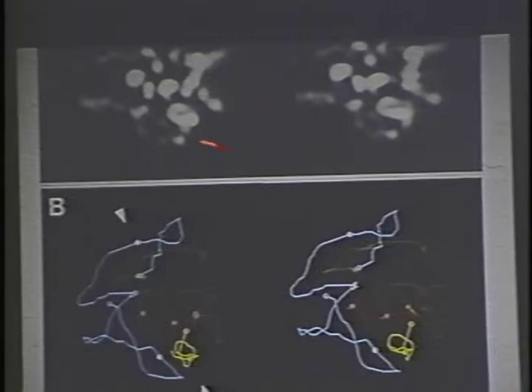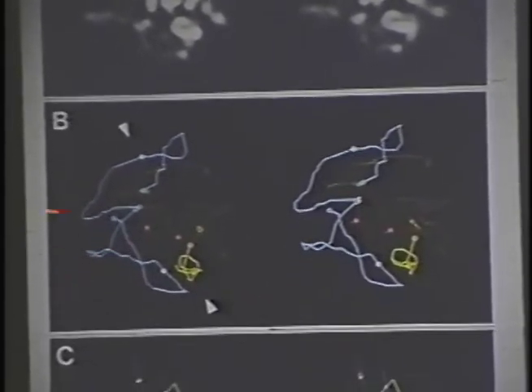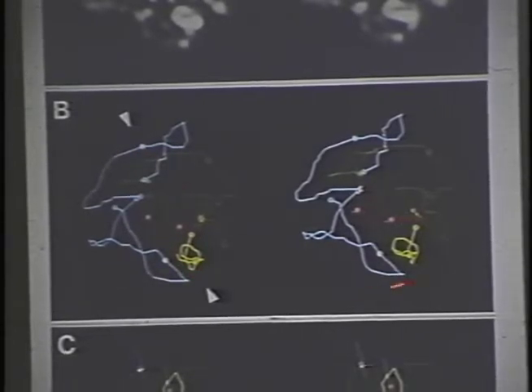It's just a simpler image to display. But this is a left-right stereo pair of a 3-dimensional volume looking at the arrangement of chromosomes within the nucleus, and it was very straightforward to then trace out the 3-dimensional paths of these chromosomes and mark which ones are which and put other distinguishing features on them, and to then look at them either in stereo or in movies, what have you.